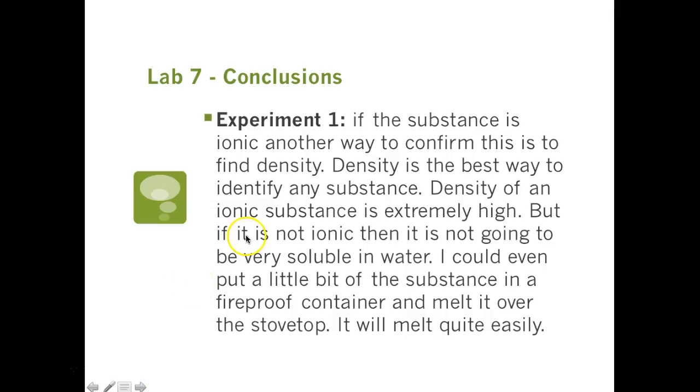So if the substance is ionic, another way to confirm is to find its density, right? Again, just try as best as possible to determine the density in terms of mass and volume. If it's very soluble in water, then it's not likely that I'll be able to use volume displacement.